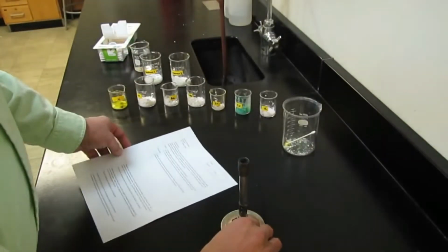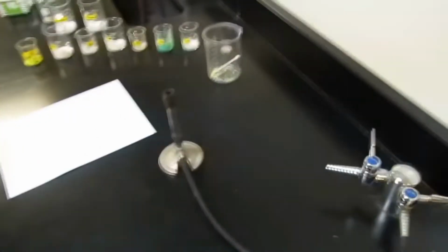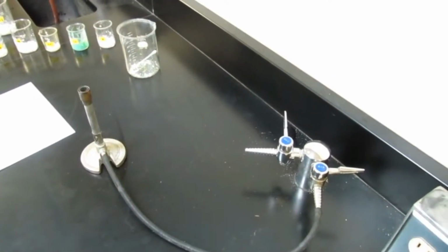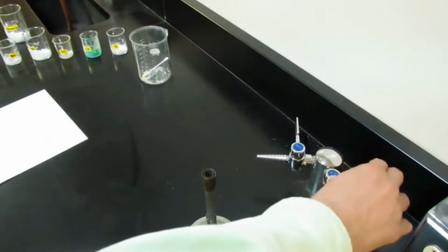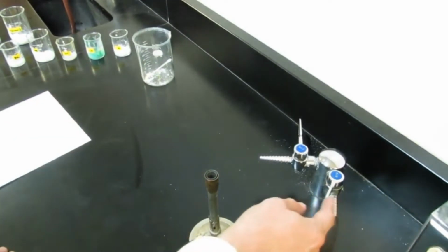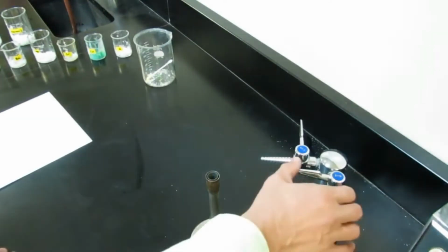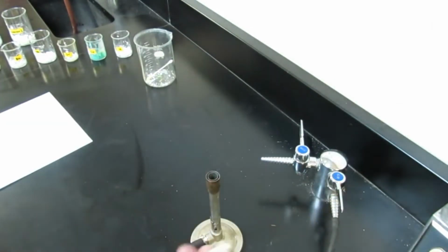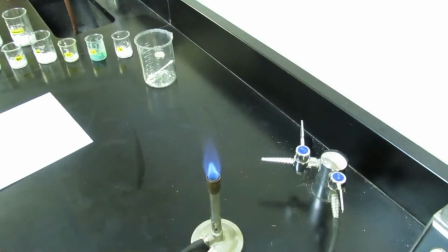Okay? So, to light a Bunsen burner, let's just quickly give you a rundown on that. You'll have a gas jet here, and to light a burner, you want to turn the gas jet 1/4 of a turn. And the gas is now on full blast. If you turn it all the way over to the other side, you've just turned the gas on and off again, and that's not going to help us. So turn it 1/4 of a turn. Now you're going to light your lighter and bring it up alongside the barrel, and you've lit your flame.